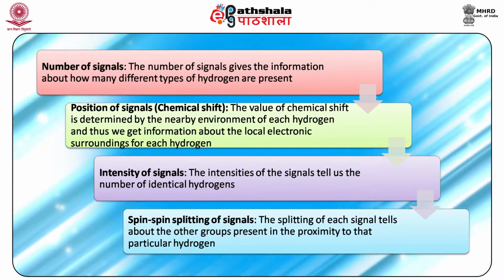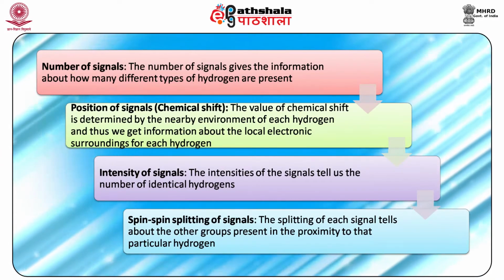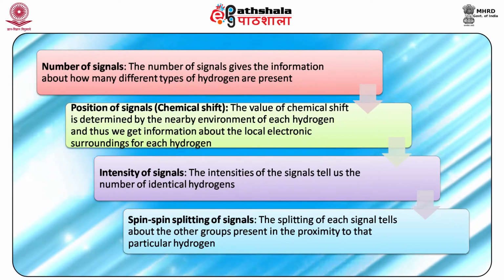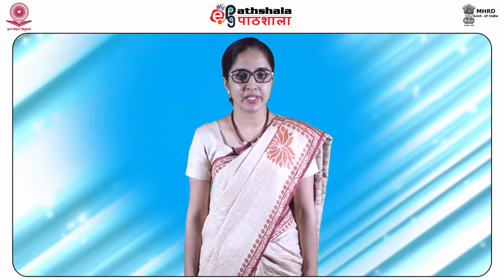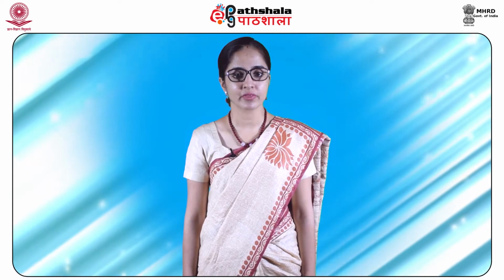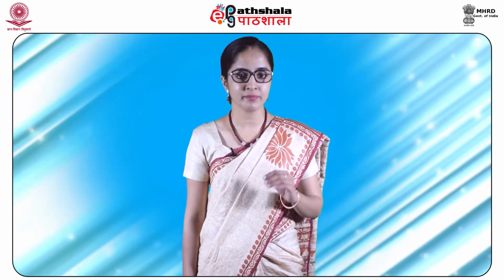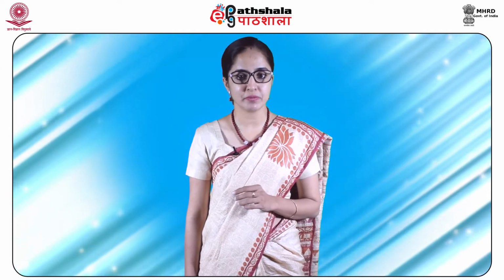Spin-spin splitting of signals. The splitting of each signal tells about the other groups present in the proximity to that of a particular hydrogen. An NMR spectrum is a plot of the intensity of a peak against chemical shift measured in parts per million, that is ppm. Chemical shifts are reported on the horizontal axis, that is the x-axis of the spectrum. Most protons absorb between 0 to 12 ppm.